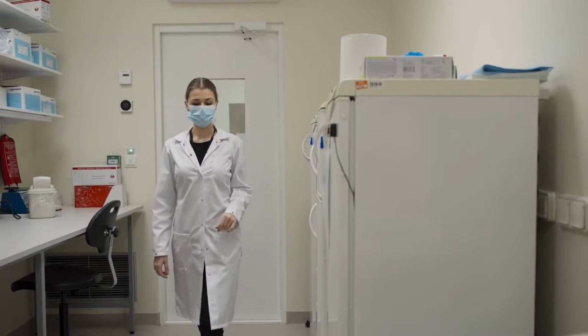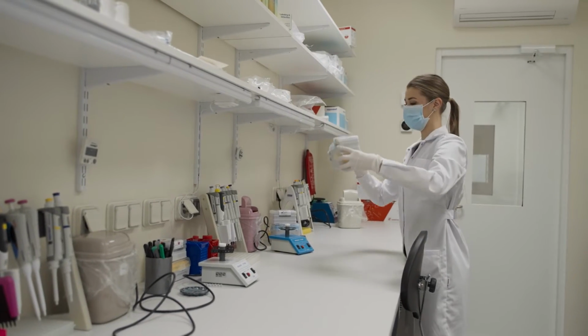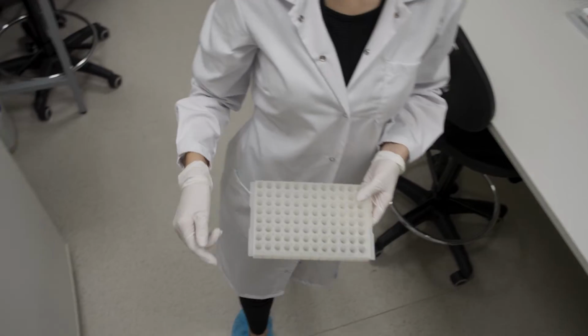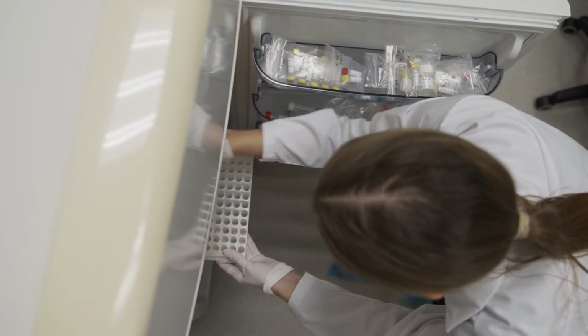Before DNA or RNA samples can be sequenced by next-generation sequencing, they must be fragmented and repaired and collected into adapter-ligated libraries. Preparation of samples can greatly influence the sequencing results.